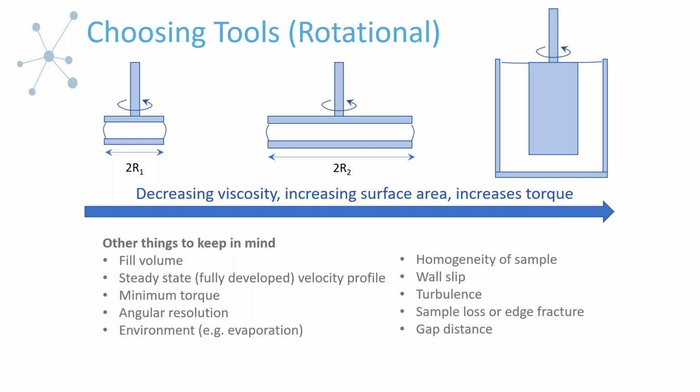We had talked about the pressure sensors that are beneath the flow channel, and we make flow channels with different pressure sensors with different sensitivities. So they're meant to operate in different pressure ranges. So you would choose a flow channel with the pressure range that you need for your particular fluid. And then also you can adjust the channel depth, which is relevant depending on the viscosity that you want to test, but also the shear rate that you want to achieve. But in general, it's always the same geometry. We're just changing depth and changing the sensitivity of the pressure sensors.